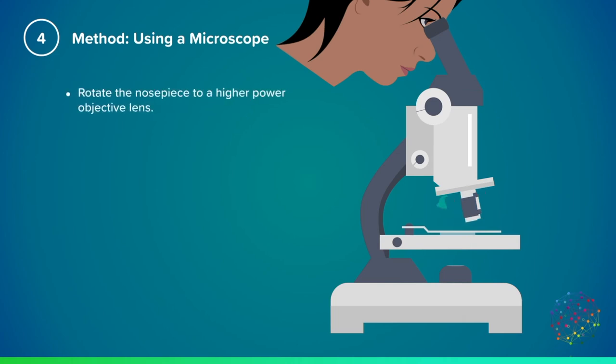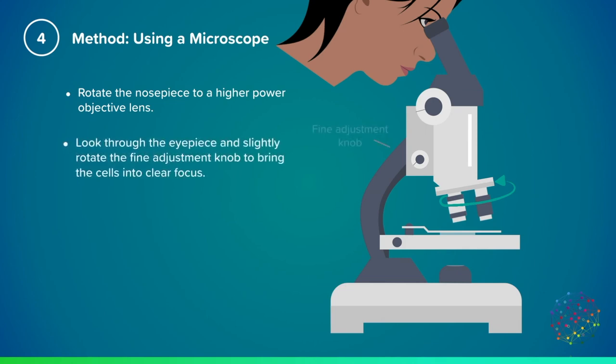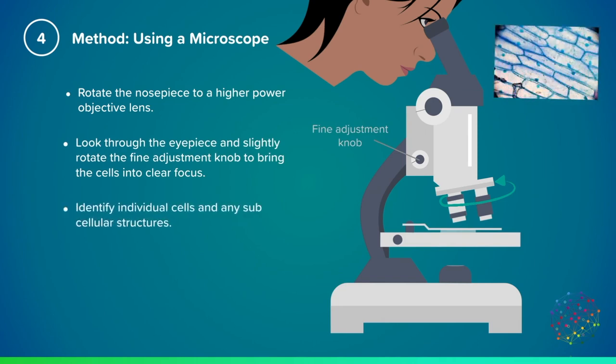Now rotate the nose piece to a higher power objective lens. Look through the eyepiece again and slightly rotate the fine adjustment knob, and this will bring the cells into clear focus. And you should notice at a higher magnification, you can see the cells in more detail, and should be able to identify some sub-cellular structures, such as the cell wall and the nucleus.